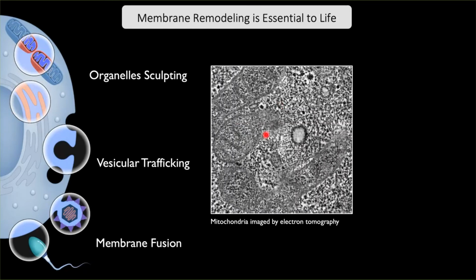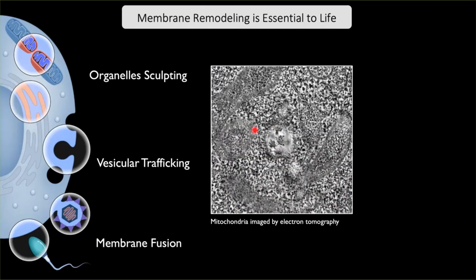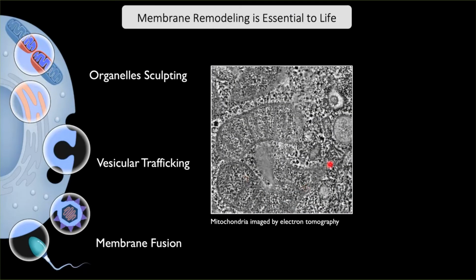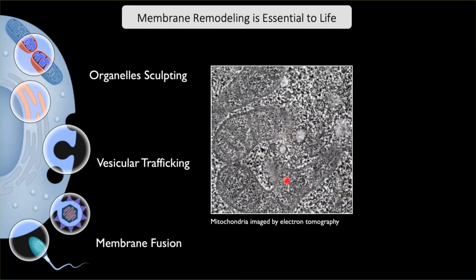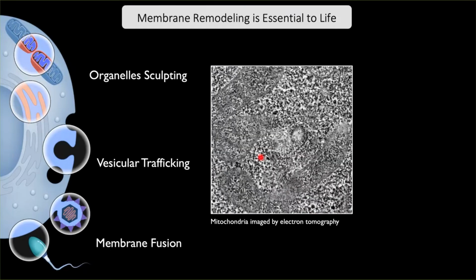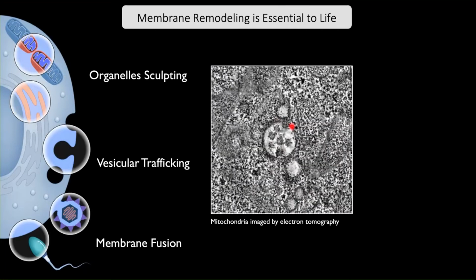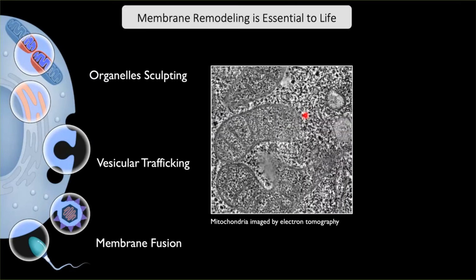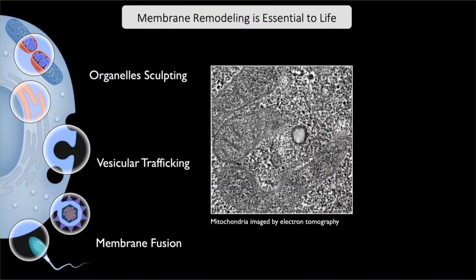And in yet another form of imaging modality, you can see two mitochondria fragments, I should say, with their internal membrane organization, and they are in some sort of close apposition, either undergoing fusion or fission. As well, you can see in this three-dimensional reconstruction some other membrane organelles around that might be associating with these mitochondria.